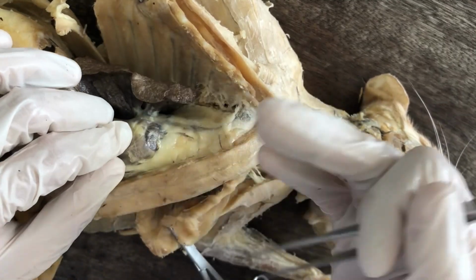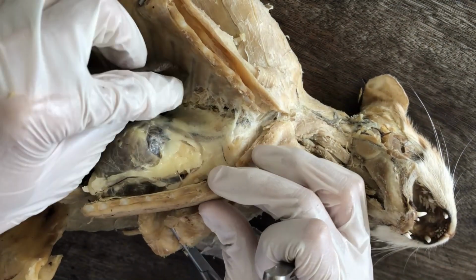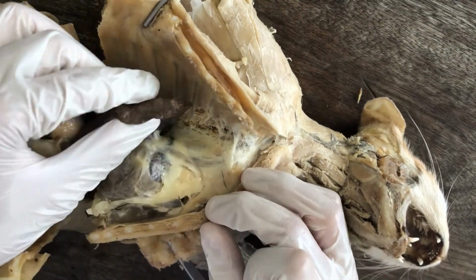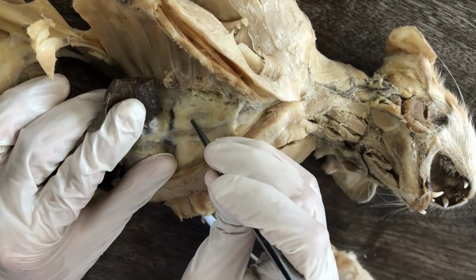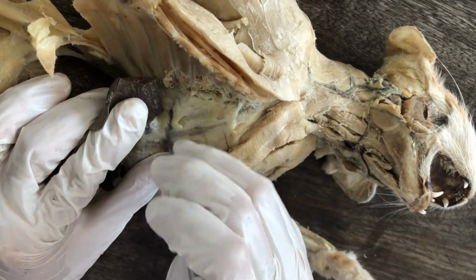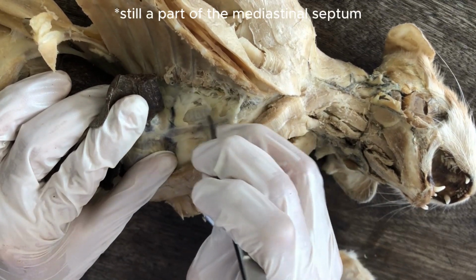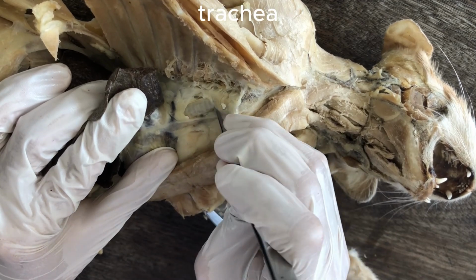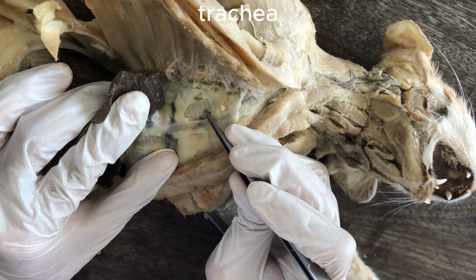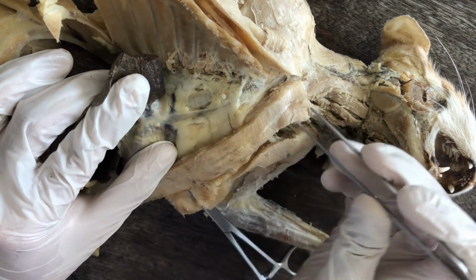But there are veins that collect all of the blood from the body back into the heart. And let me see if we can see them yet. This one, let me rip some connective tissue so you can see them. So that's a trachea. It's obvious because of the tracheal rings, right? The trachea is reinforced by cartilaginous rings.